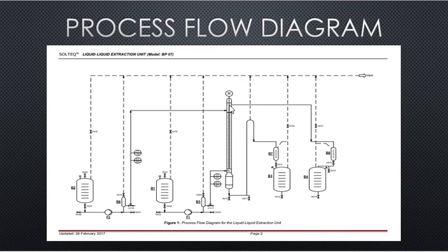The function of the stirrer is to stir the solvent and the mixture. The stirrer functions to mix both solutions, or both liquids, well. So this is the PFD.